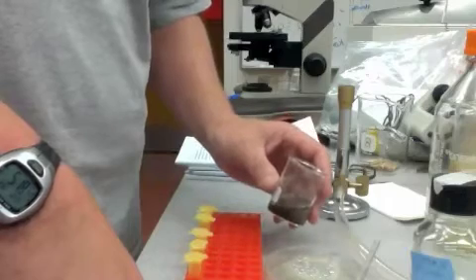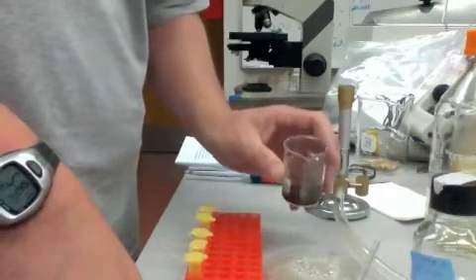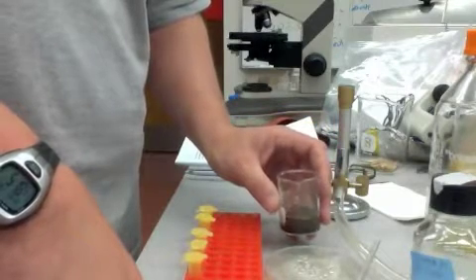So you have to make a dilution, a series dilution. So what you do is you make a 1 to 10 dilution of your sample. In your case, it will be a sample from your dissolved pellets.